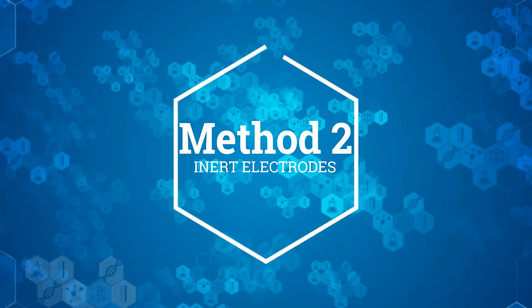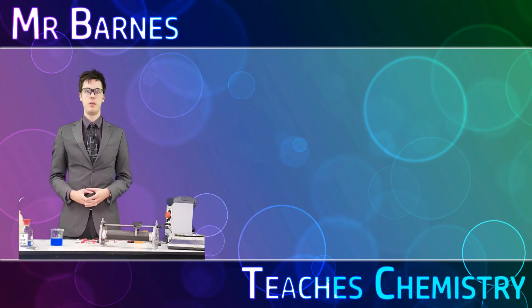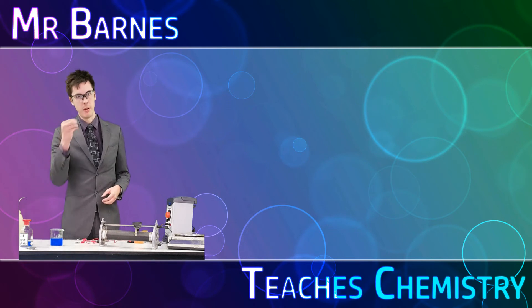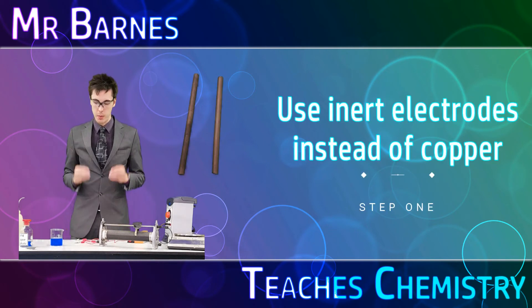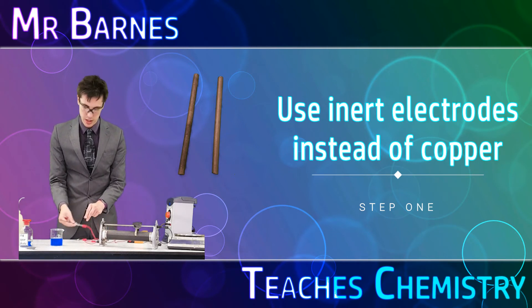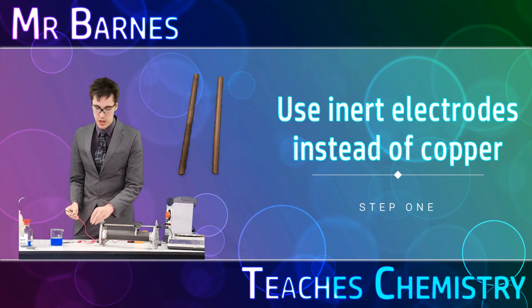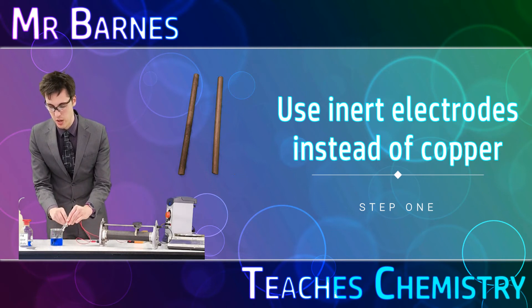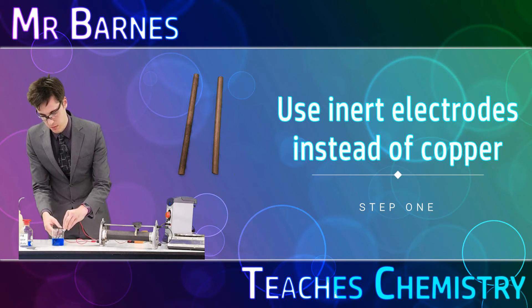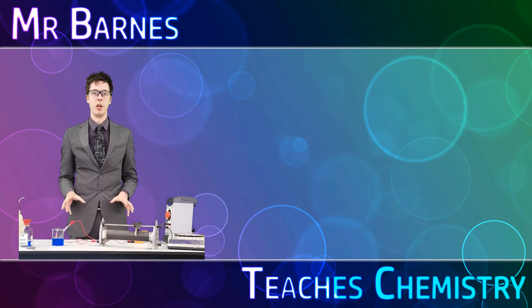The second method we're going to have a look at is a nice quick one looking at inert electrodes. We do exactly the same setup again but with graphite electrodes, which are inert electrodes. This time you don't need to do it with all the different currents and you don't need to weigh the electrodes beforehand. All you're doing here is observing what happens to the electrodes. Put the electrodes into the solution making sure they aren't touching, turn the power on and leave it a little bit to see what happens.